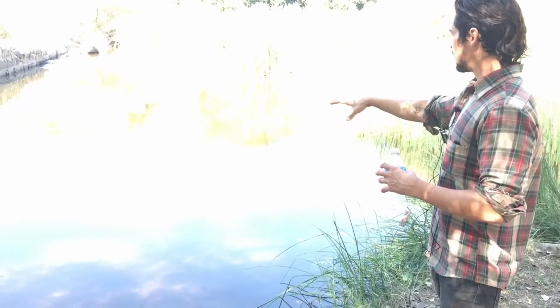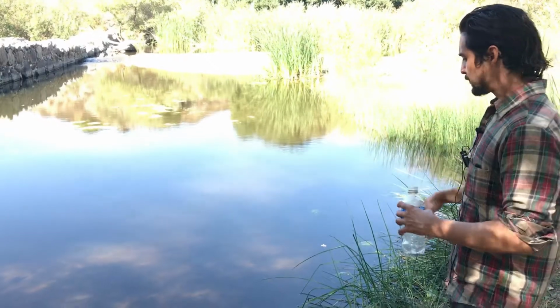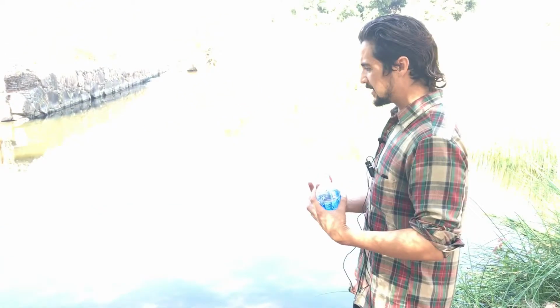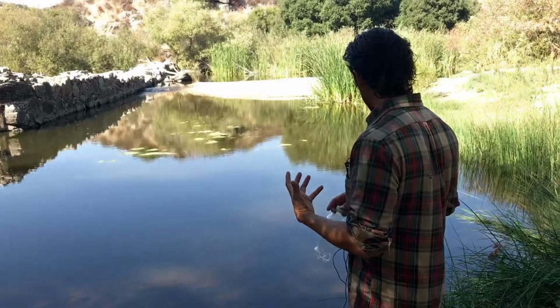Here there's an area in the center that's pretty clear. There's not a lot of stuff in it. Towards the edge is a sandy area here, which is pretty clear as well. But what I'm looking for is an area that is kind of grimy. It has some algae growing. It has a lot of microorganisms, things that are growing, things that are moving around. Probably the worst water to drink. That's kind of what I'm looking for.